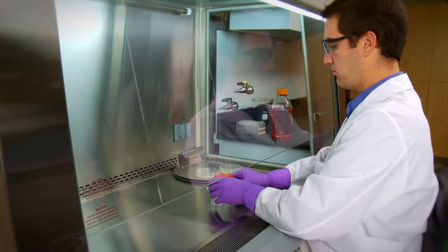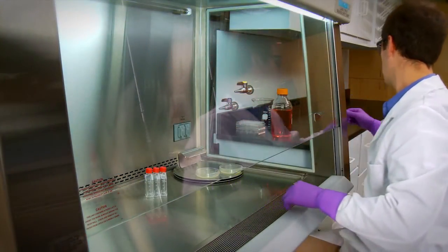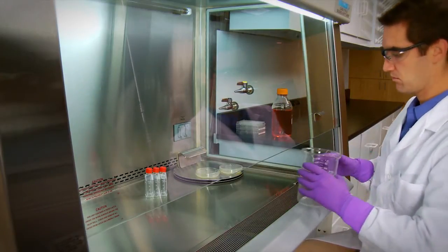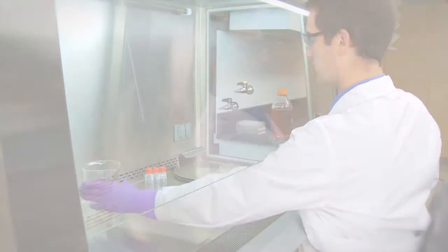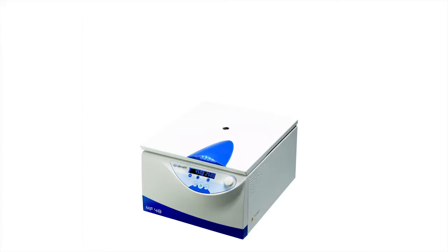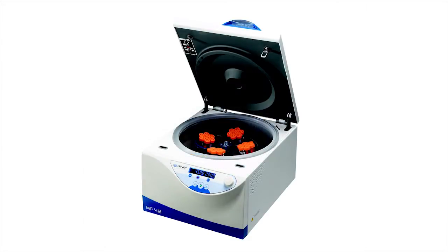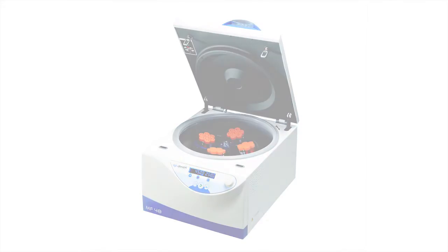All materials should be placed as far back in the cabinet as practical, toward the rear edge of the work surface and away from the front grill of the cabinet. Similarly, aerosol generating equipment such as vortex mixers or centrifuges should be placed toward the rear of the cabinet to take advantage of the air split.